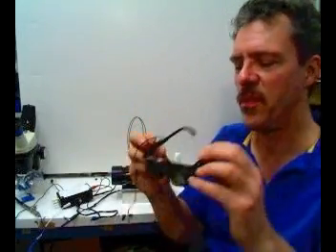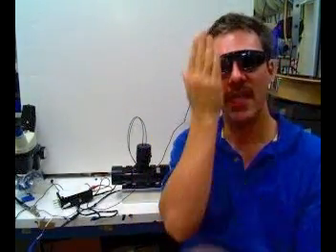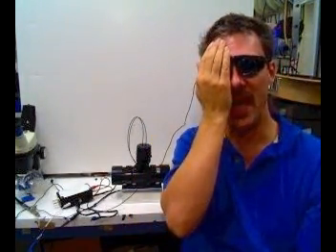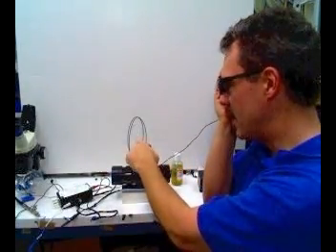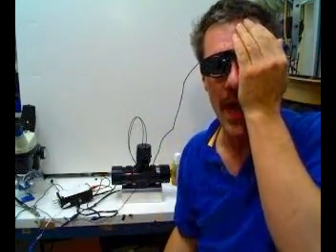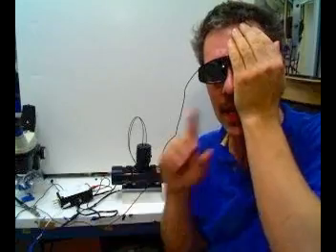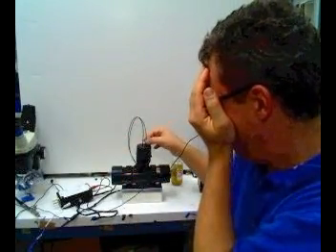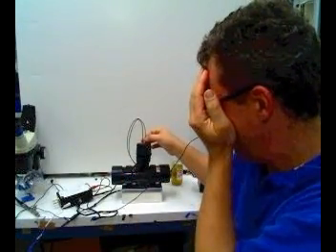But if we view them with these shutter glasses, what this will do is it'll let us see with our left eye the image that occurs when the left fiber optic is illuminating the subject. And when the right eye is open, it'll let us see what's being illuminated when the right fiber optic is illuminated. This will create a 3D image.